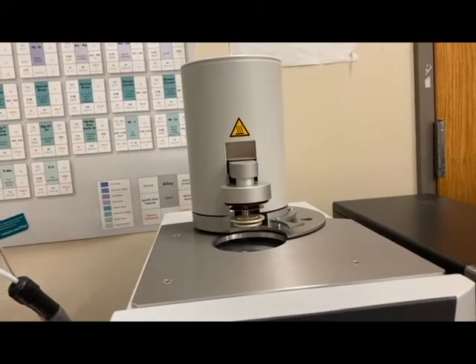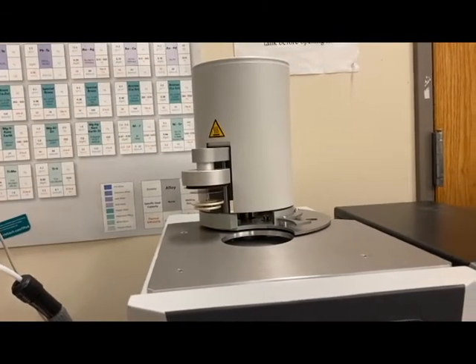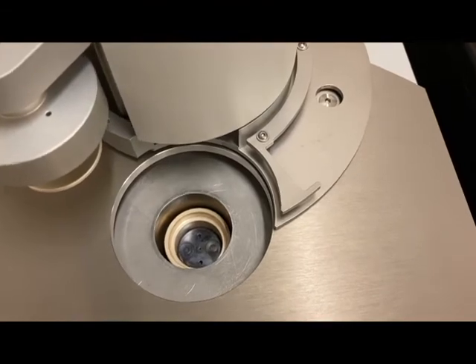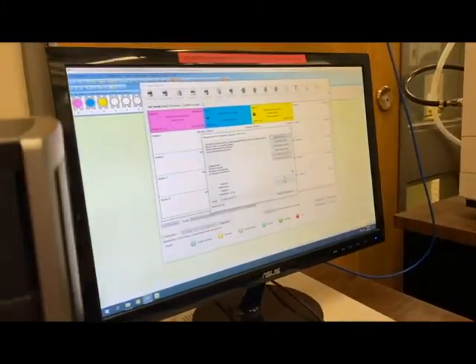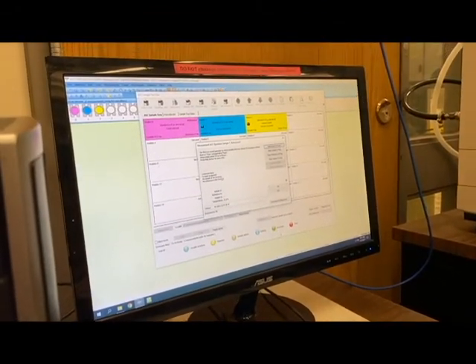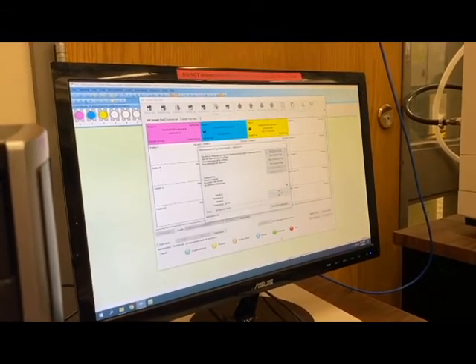You can open and close the furnace to double check. Click Open the Furnace — you can see the auto sampler pulls the lid up and off, at which point you can check inside the furnace to make sure there's no crucible in there. You can see there are two locations, two little sensors for those pans, and both are empty. If there was something in there that the auto sampler didn't know about, you'd want to remove it. Everything looks good here, so click OK.